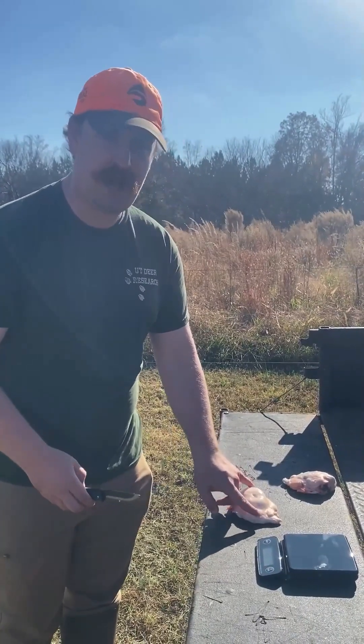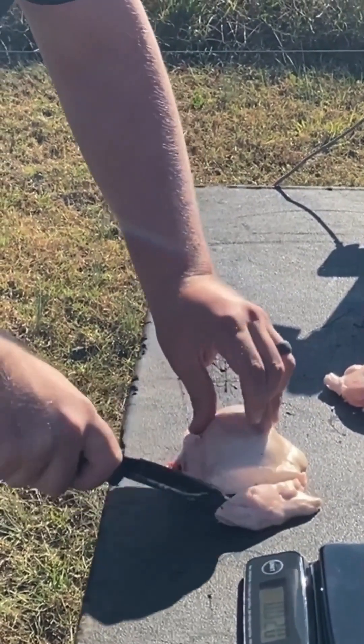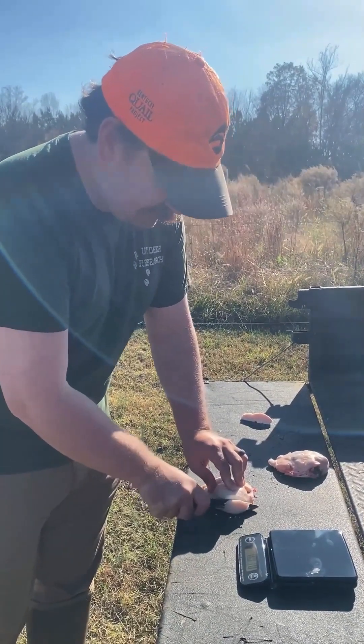What you do is you just cut the fat off of both ends of the kidneys — you just cut straight along like that to where you're just barely right at the side of the kidney, and then you cut the fat off the other end, just like that.